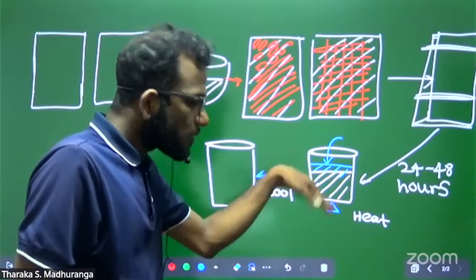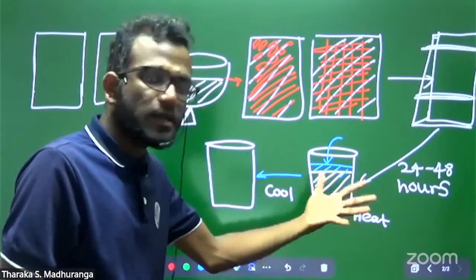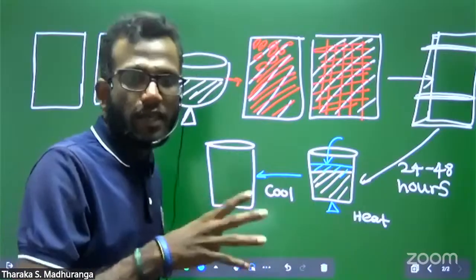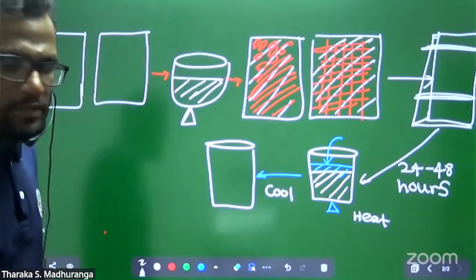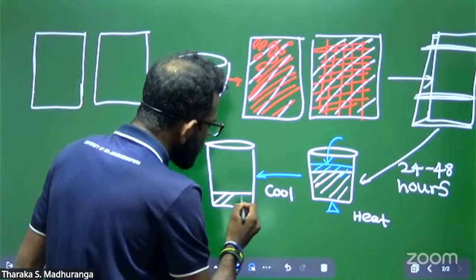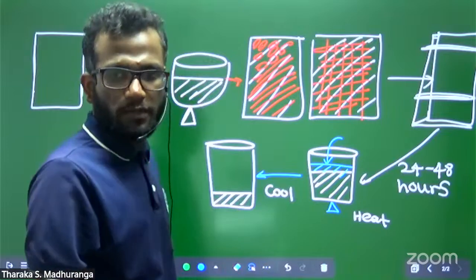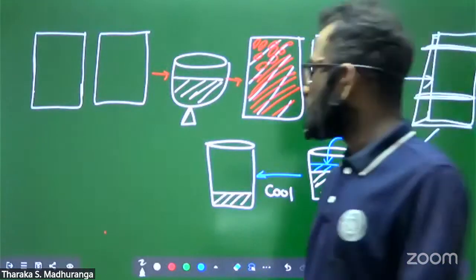After that, all the solution becomes the same solution. Then we need to cool this mixture. After cooling, the wax layer converts into a solid again.